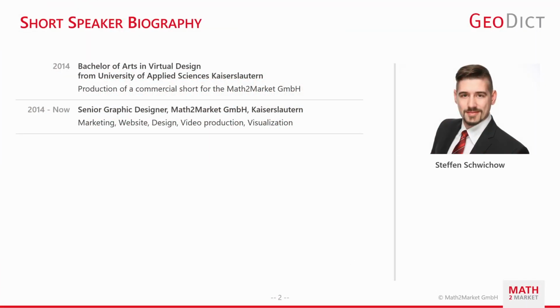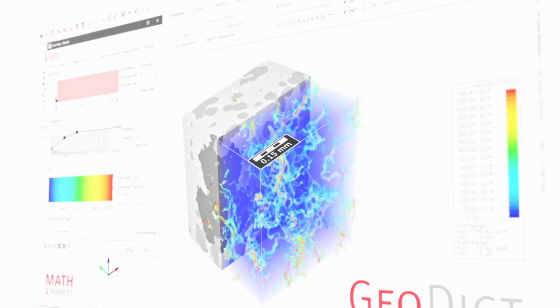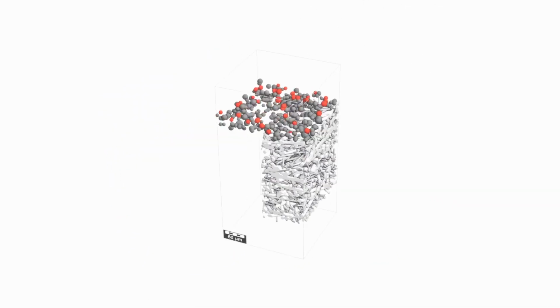I'm a senior graphics designer here at Math2Market, and in this workshop I will show you how to use the visualization features in GeoDict 2022 to create impressive images and animations of your 3D image data, your microstructures, and your simulation results.